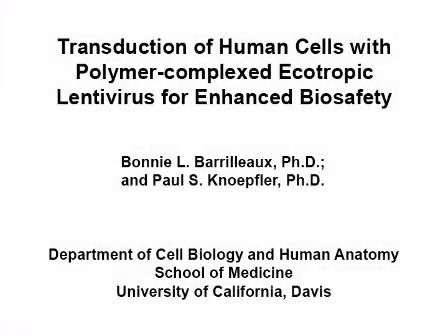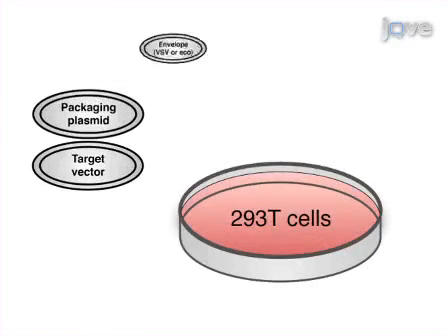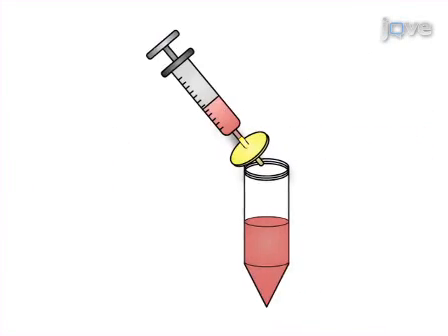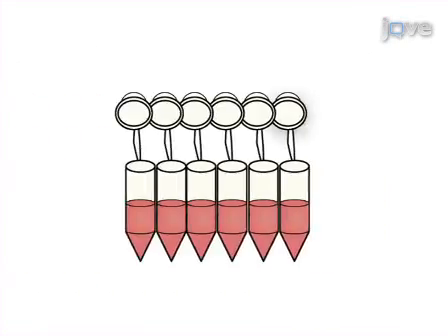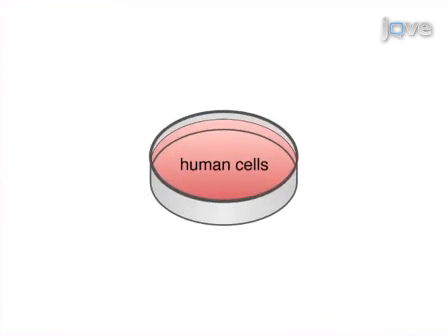The overall goal of the following experiment is to introduce oncogenes, or other potentially hazardous genes, into human cells using ecotropic lentivirus. This is achieved by producing pantropic lentivirus encoding the mouse retrovirus receptor, as well as ecotropic lentivirus encoding the gene of interest.